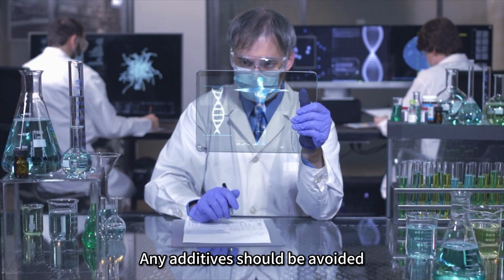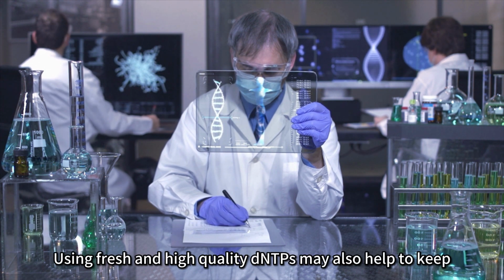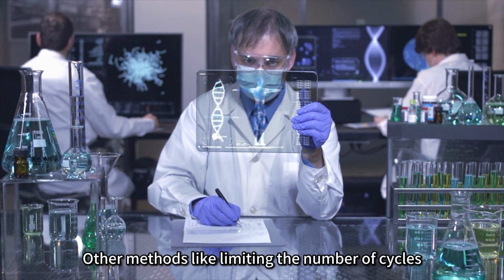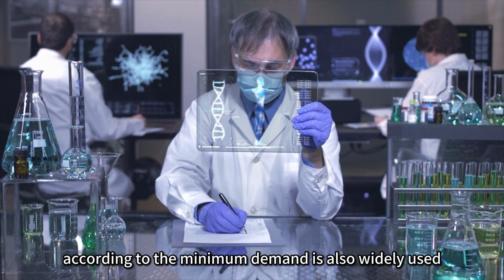Any additives should be avoided. Using fresh and high-quality dNTPs may also help to keep the high fidelity of polymerase. Other methods like limiting the number of cycles according to the minimum demand are also widely used.